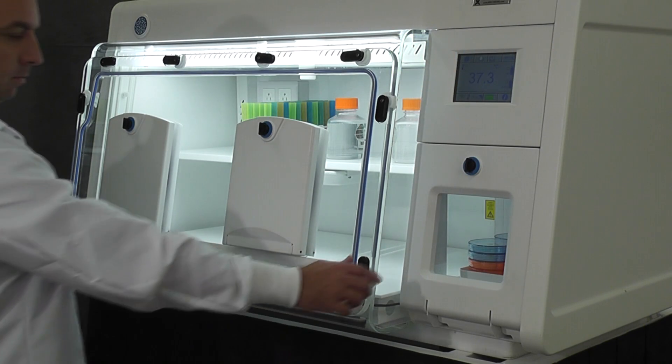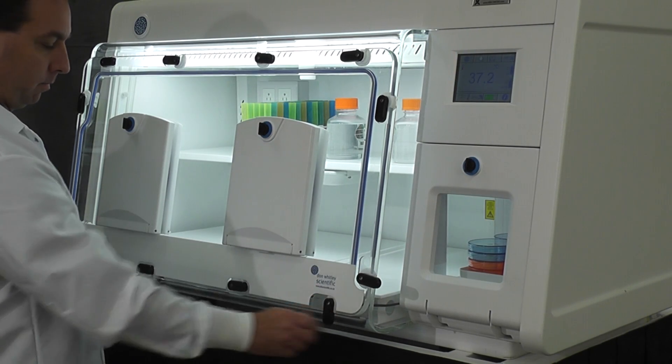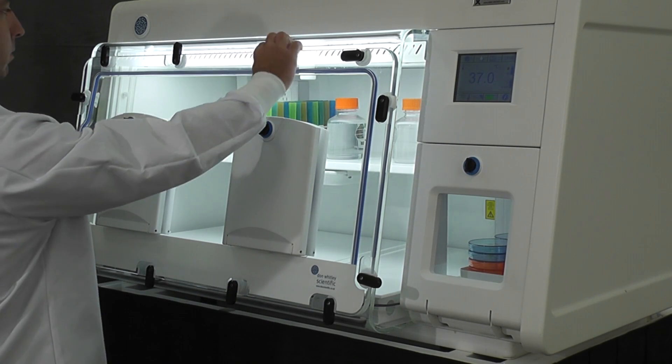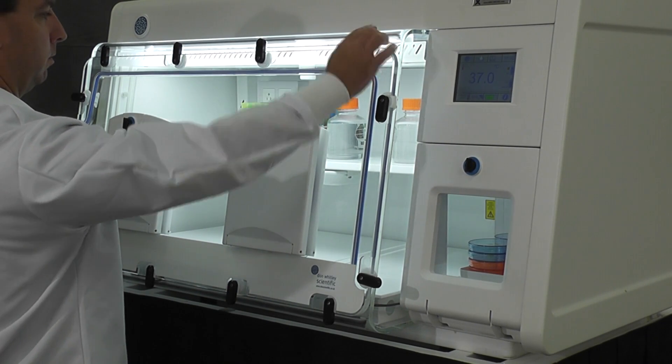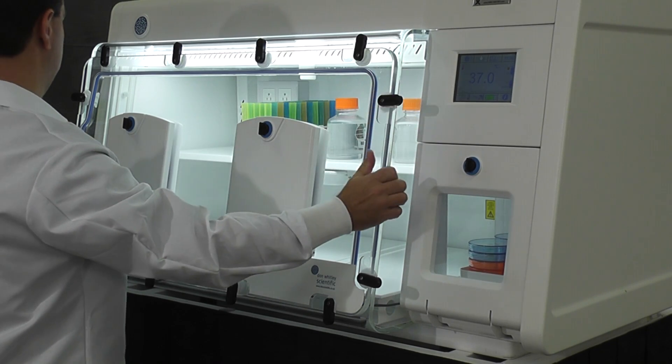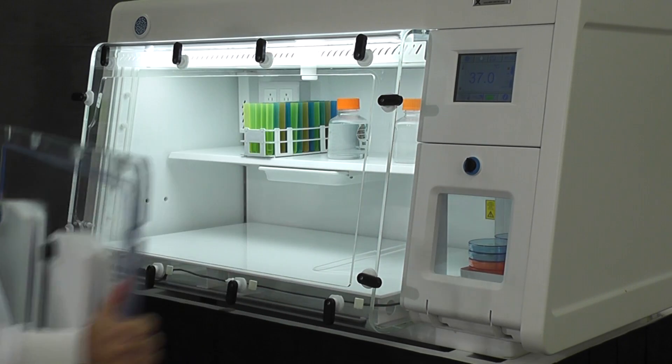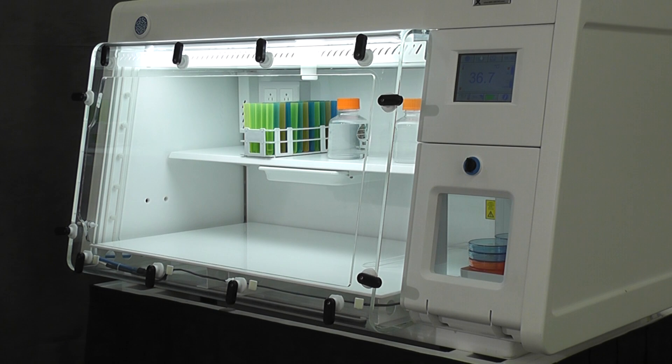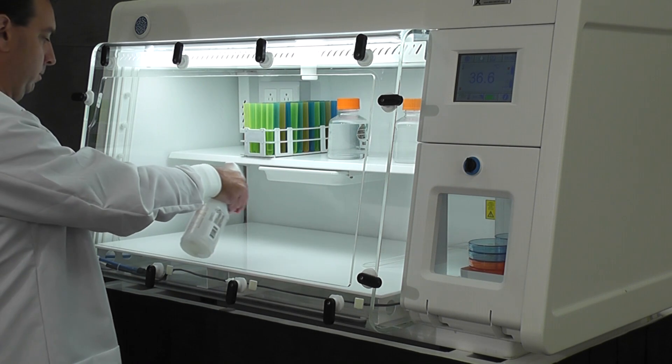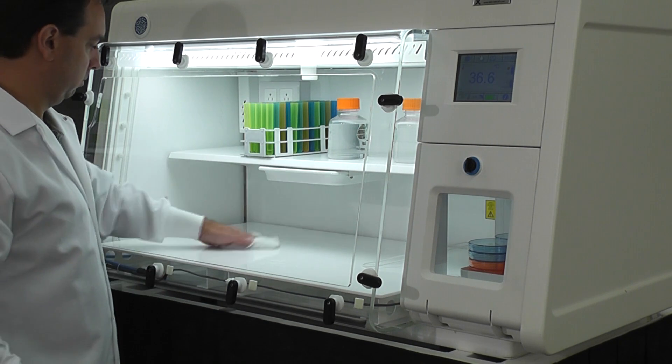The A35 is available with an optional removable front. Simply release the latches surrounding the perimeter of the front shell and using both hands lift the front away from the cabinet. This feature facilitates easy decontamination between experiments and the introduction and removal of large pieces of instrumentation.